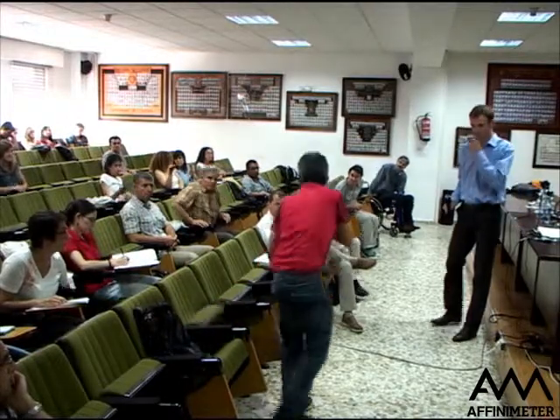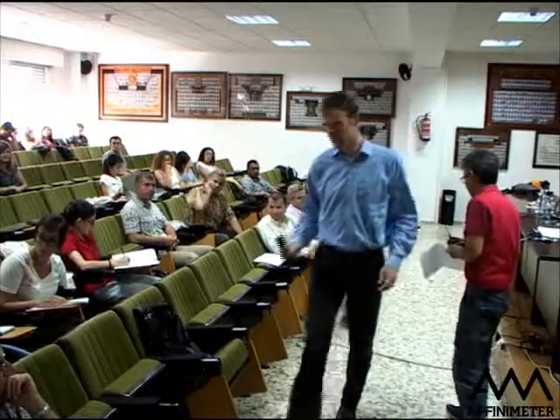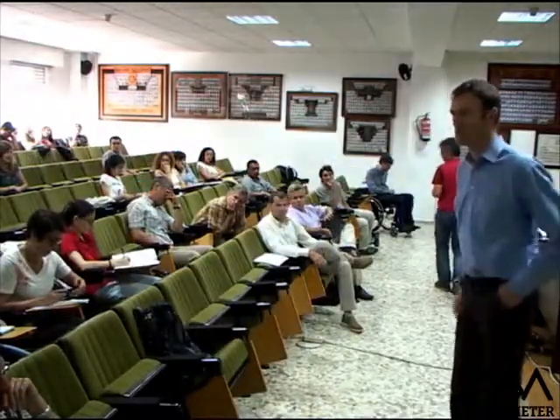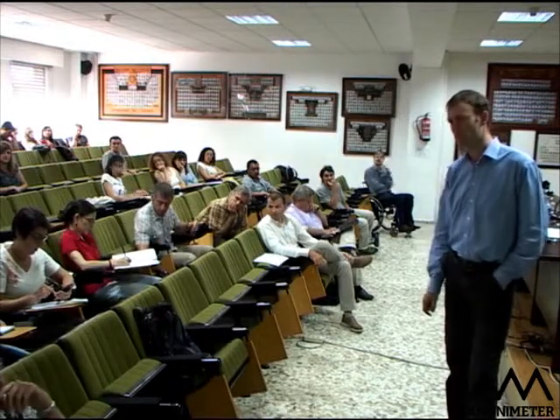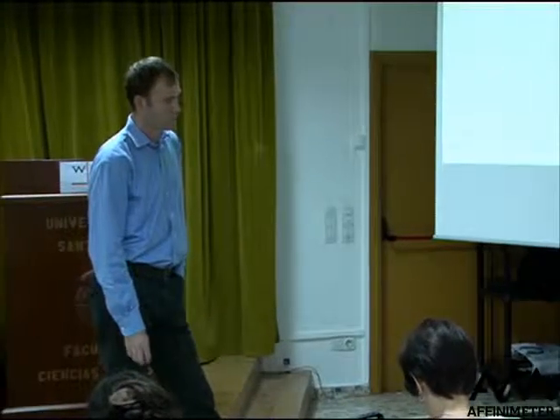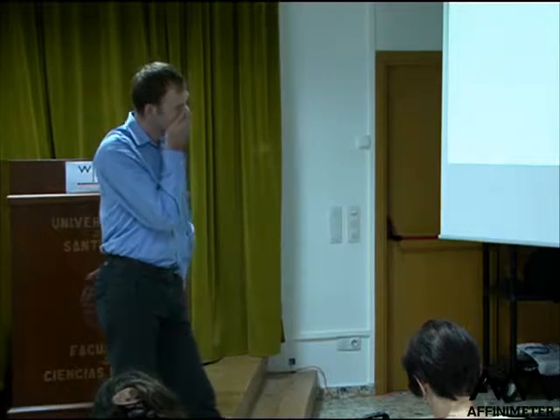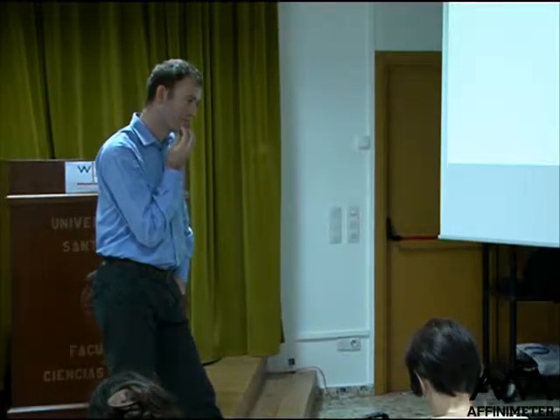Okay, we have time for questions. This is a question, I think, again from Stefan Geschwinder from AstraZeneca. He asks, how often can you relate energetics ITC data with structural biology? In the sense of, can you relate a delta H value with a structure where you see a hydrogen bond being acquired?